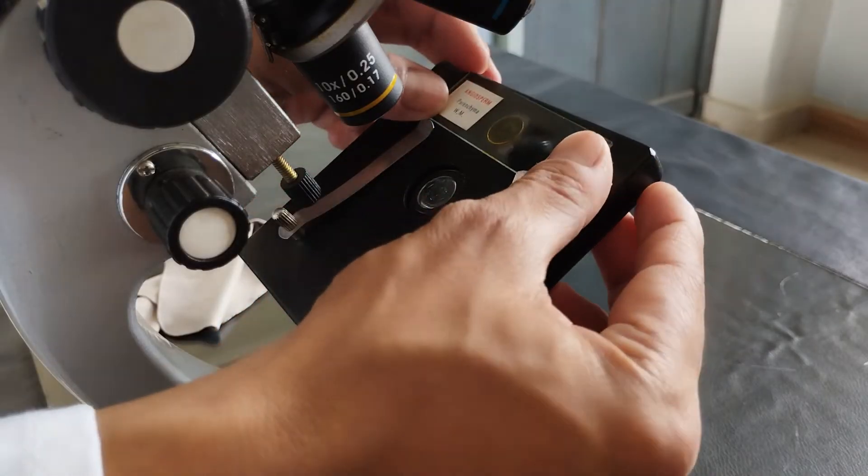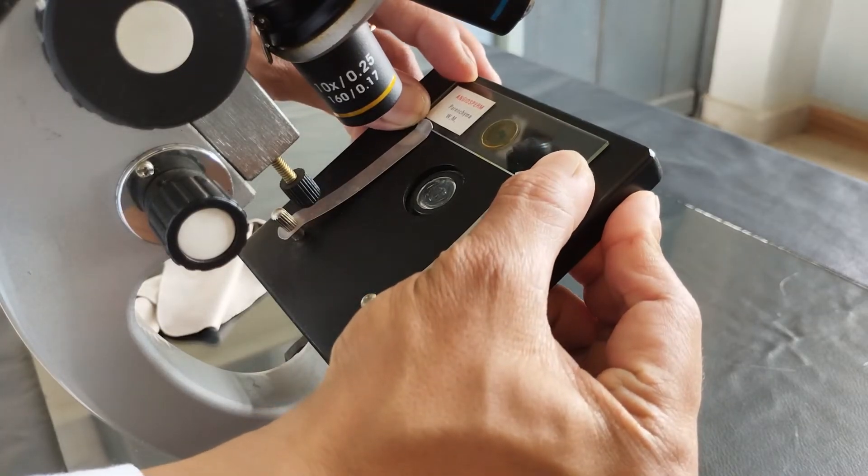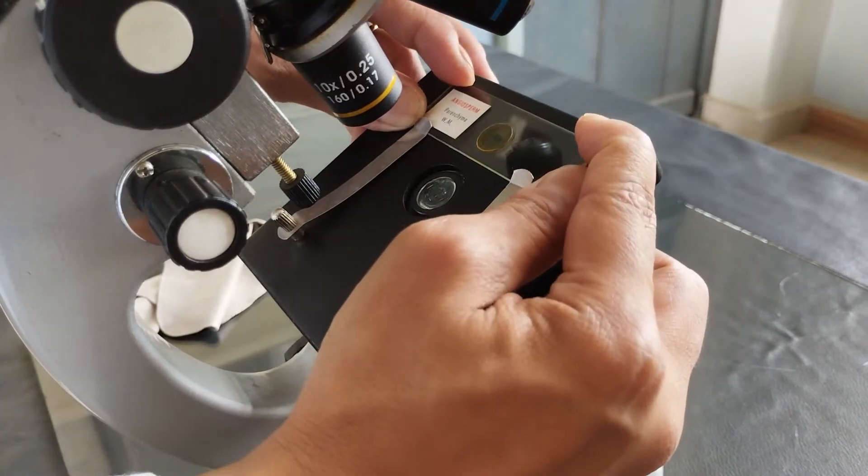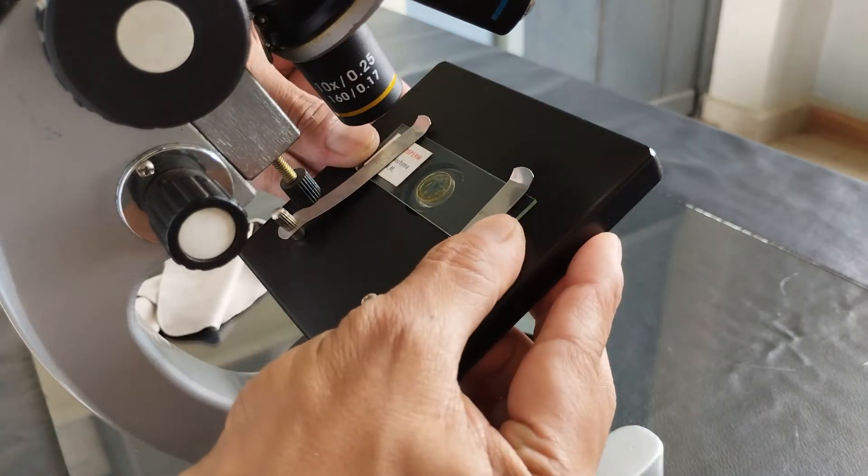Now, place the prepared slide containing the specimen of interest onto the stage. If the stage is of a simple construction with two spring clips, simply slide the glass slide from the terminal ends of the clips like so.